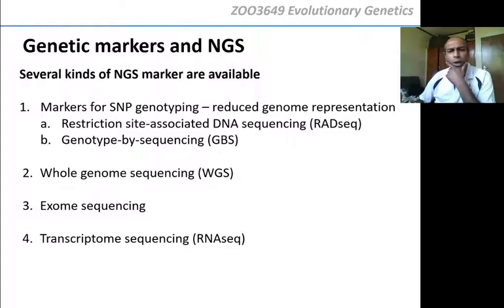The transcriptome sequencing, which is RNA-seq, is also not sequencing the whole genome. It's only sequencing what? The messenger RNA transcripts. So what do you need to do? You know this from 2544. You need to take a sample from a tissue, extract what? RNA, not DNA, and change it to DNA using what? Reverse transcriptase, and then what? Sequence it using NGS, right? That way you get the sequence of every messenger RNA that is being expressed in that cell.